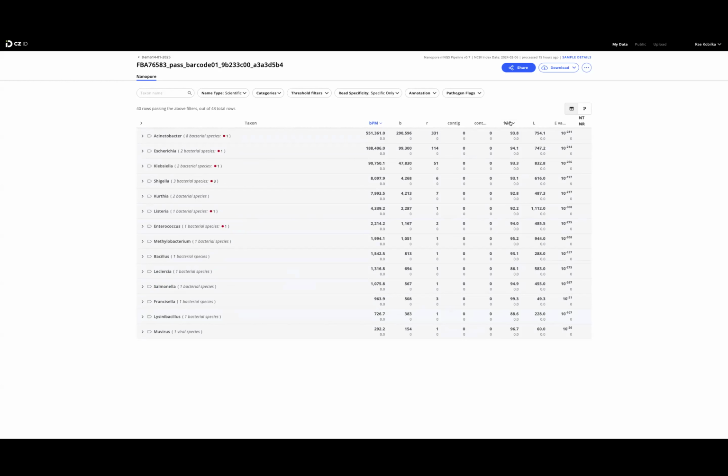I'm wondering how we can be confident when we choose. Here, I think we have 94% for the second bacteria, Escherichia coli. Yeah, because we have already 93. I think we have so many species that have a high score. Yes. How?